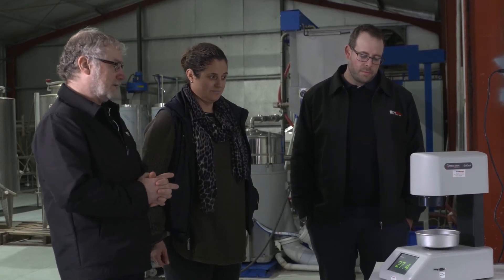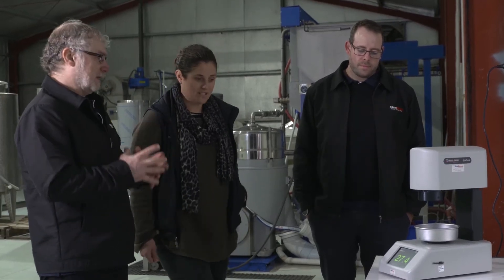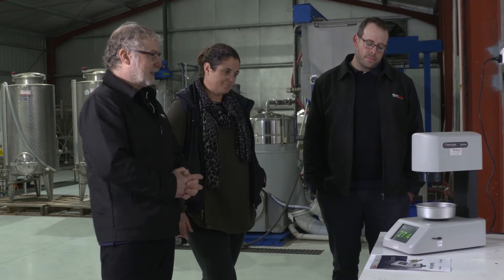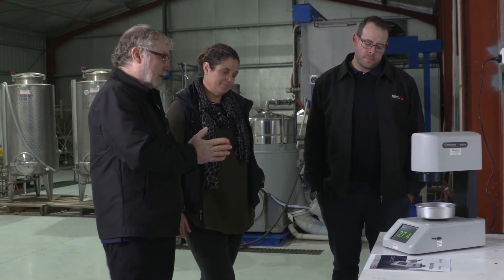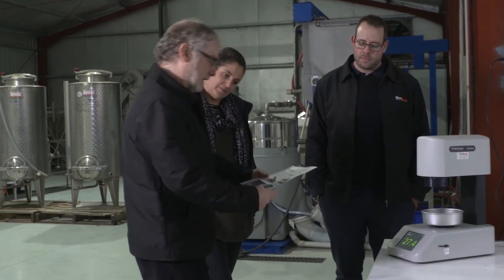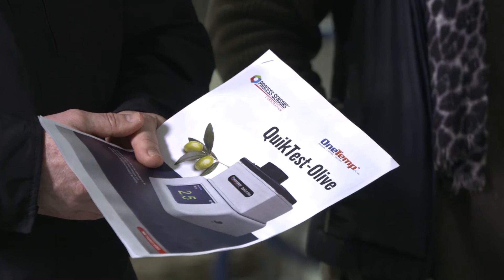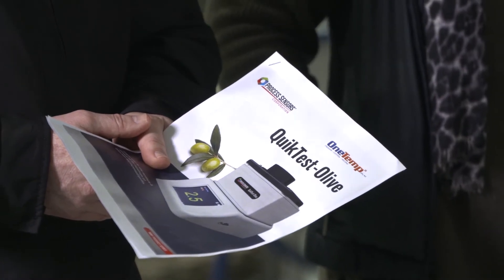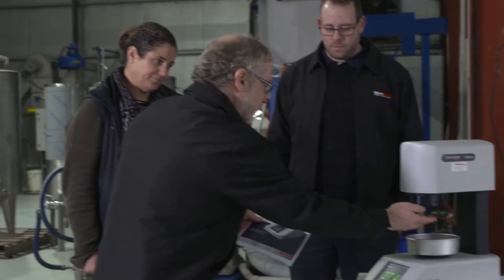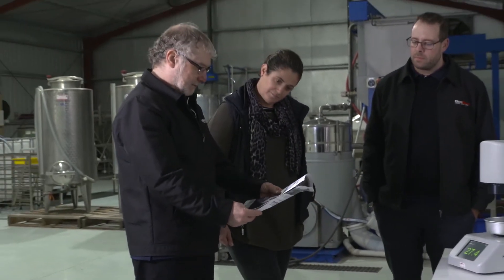So what we're trying to pick up there is your best oil content and to pick it at the right time. This one is our older model. There's a new model just hot off the press which does away with the top section and it actually views from the bottom. It's a near infrared that looks down in there and picks up the oil content of your olives that way.